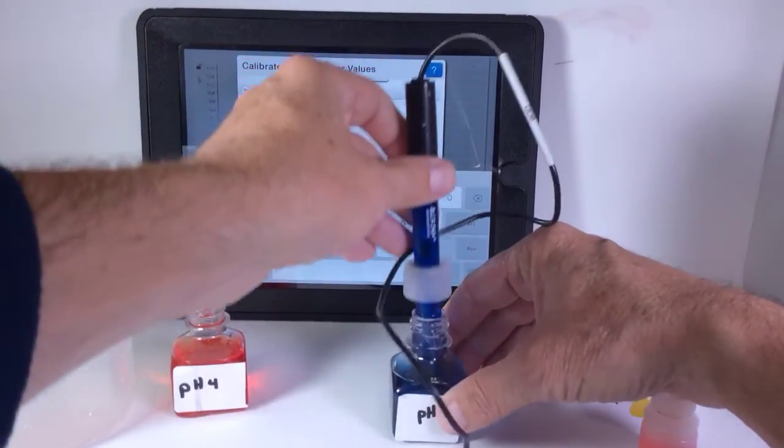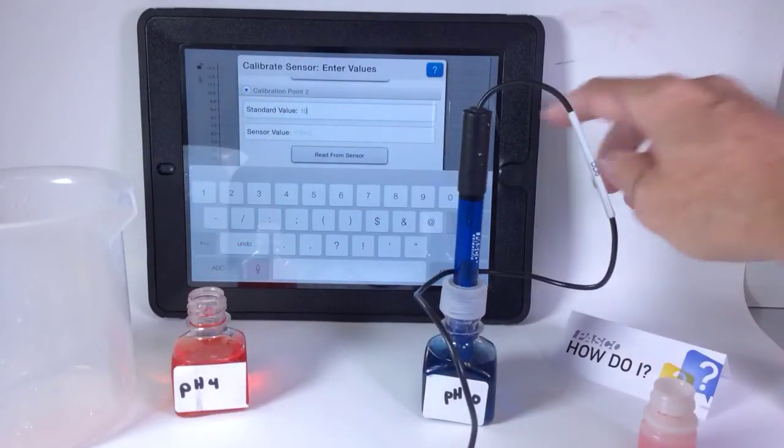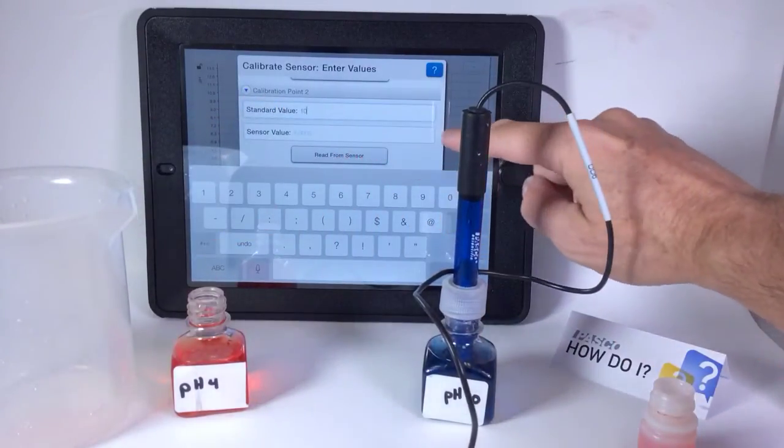I'm going to place this in the solution, wait for a moment, and then hit read from sensor.